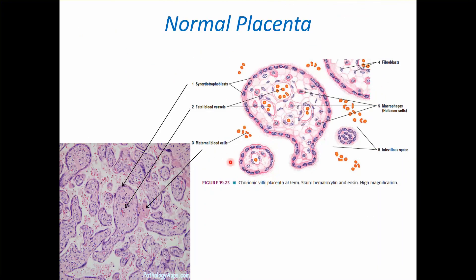Now coming to placenta. The outer lining is the syncytiotrophoblast of the villi. Inside you have the fetal blood vessels. All these are cut sections of different villi. Inside the villi you can also see macrophages called Hofbauer cells. Between the villi you can see the intervillous space, which contains maternal blood cells. So outside is the syncytiotrophoblast, the blood vessels are fetal, and between the villi you have maternal blood cells.